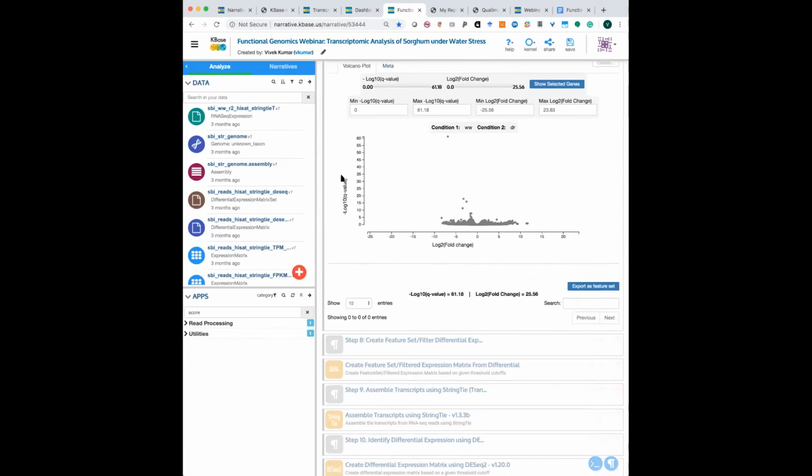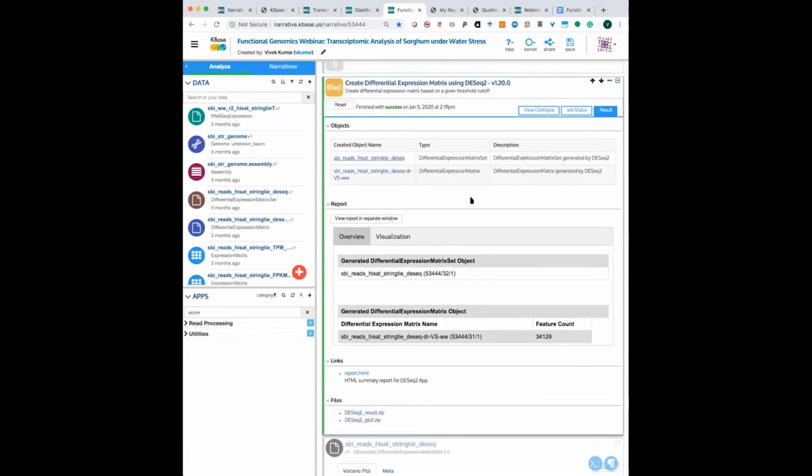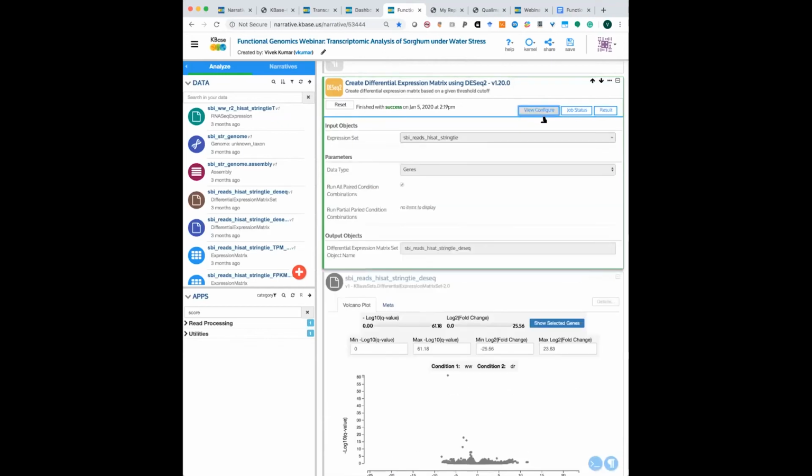Now, remember that this is a differential expression for thousands of genes, and we're trying to see which genes have differentially expressed across thousands of genes. So for every gene, there's a possibility of a false positive. So that's the reason we compute the Q value, but that will be captured in a later step.